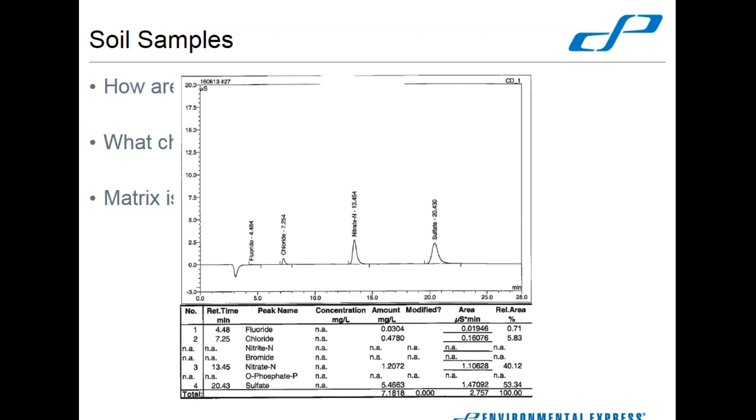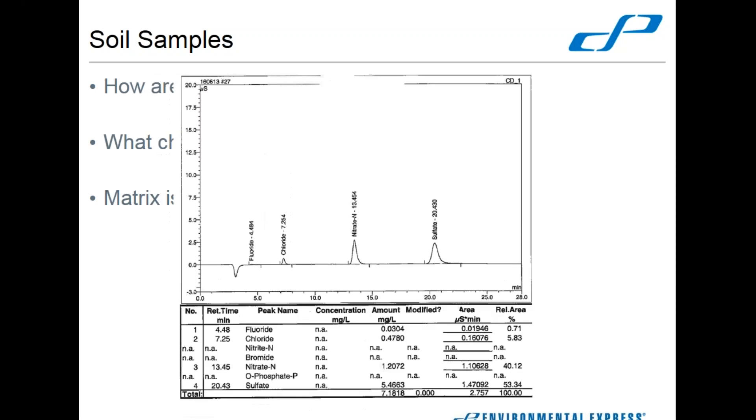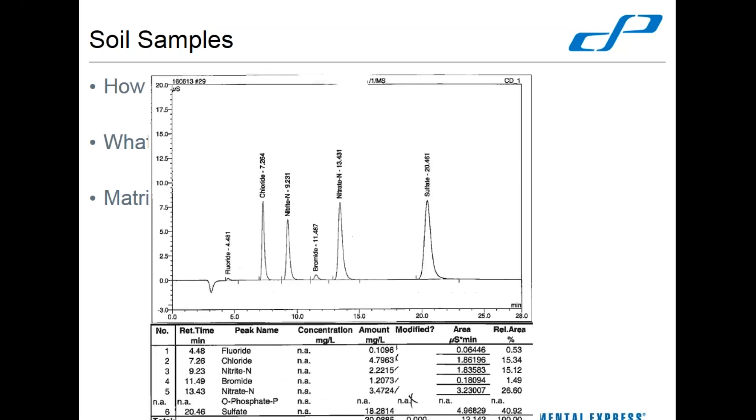When you spike soil, you do it prior to extraction. A lot of things in soils like to eat orthophosphate and bromide. Here's our raw sample — and this is our spike. We've got three distinct peaks plus fluoride — four named peaks: fluoride, chloride, nitrate, and sulfate. And see that fluoride? It's only 0.1, and I can guarantee you that was supposed to be a 2.5 spike. So we've essentially lost all of our fluoride. And orthophosphate — you don't even have a peak for orthophosphate. It's just gone.